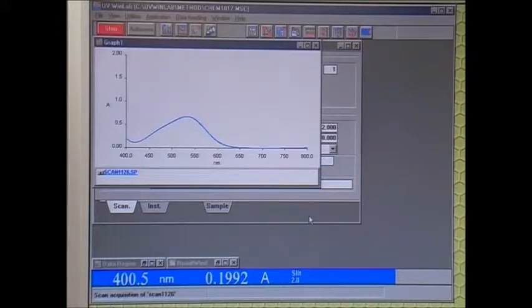Try to ensure that the concentration of the solution is not too strong so the peak doesn't go above the graph, or too weak that there is no peak. The example shown here is about perfect.